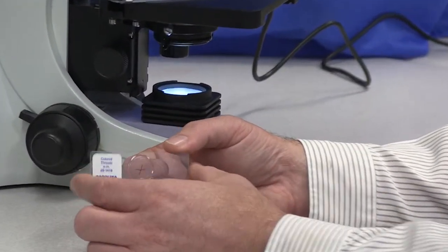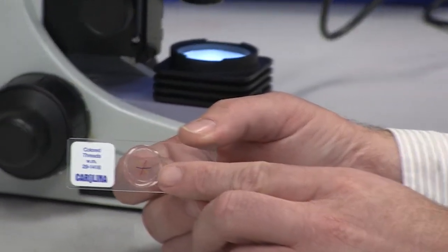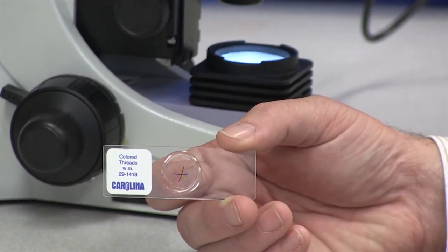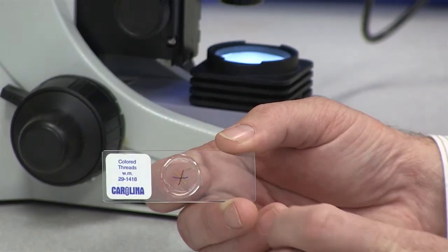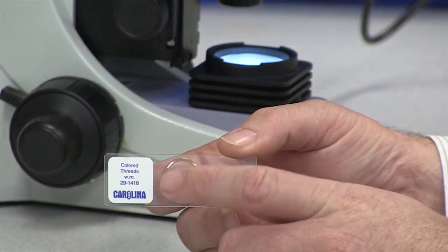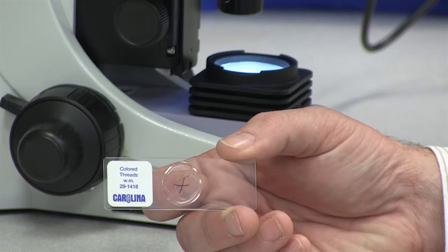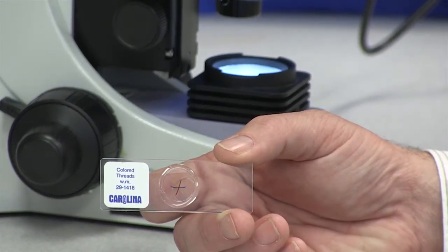As you can see, this is just a glass slide with three small pieces of colored thread placed on the slide, crossing one another. There's a little round glass disc on top of the threads called the cover slip.